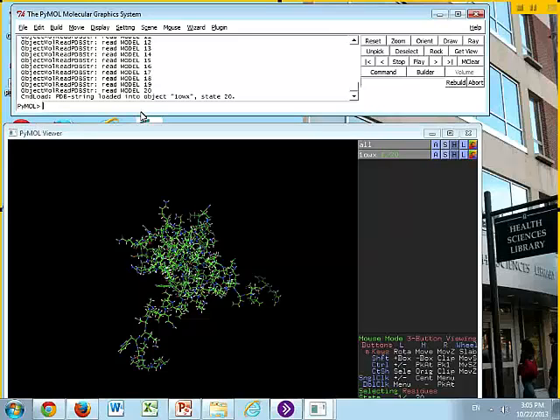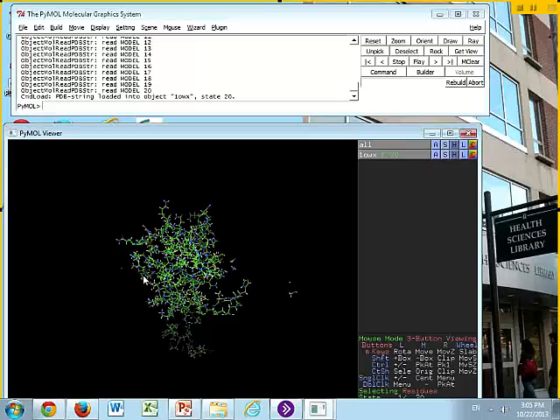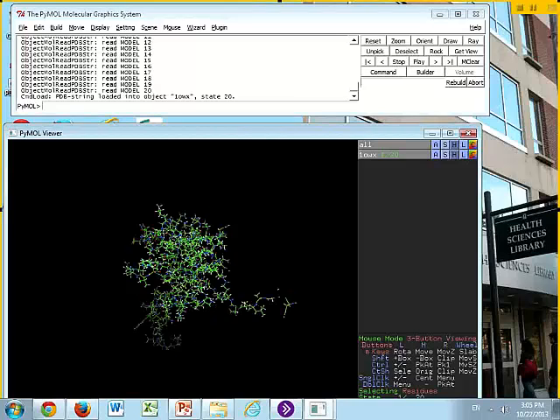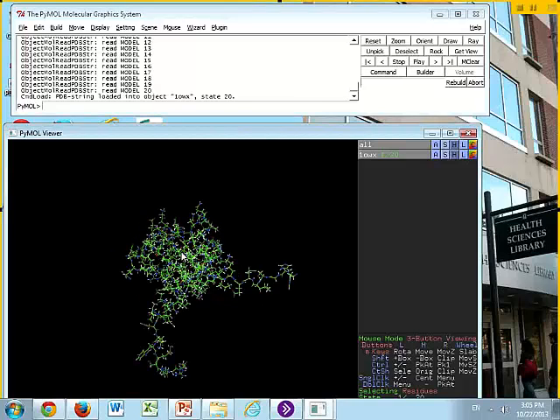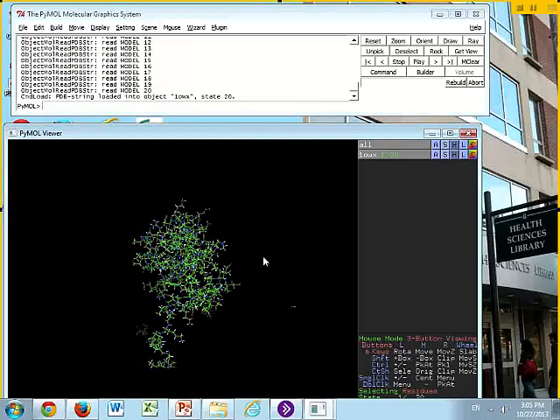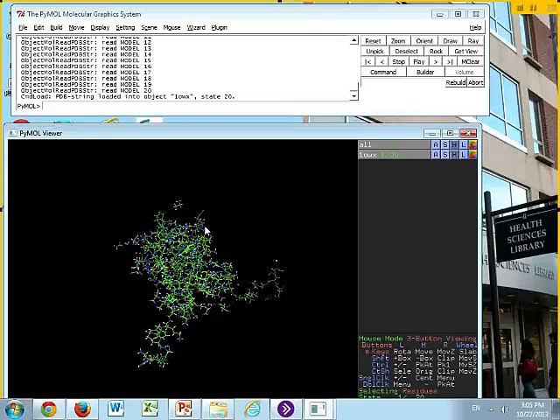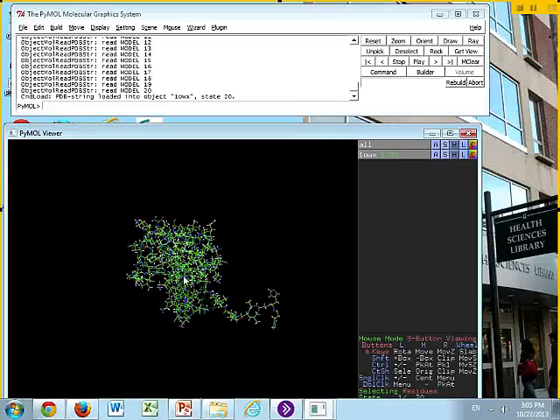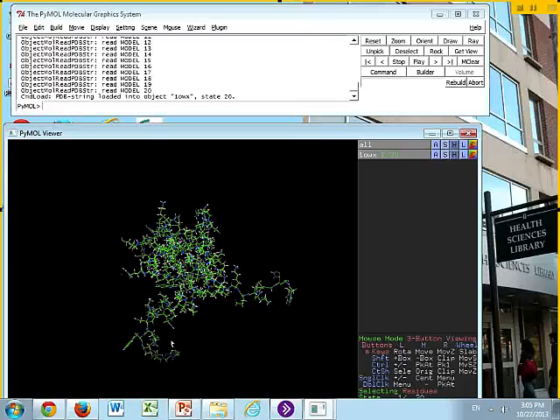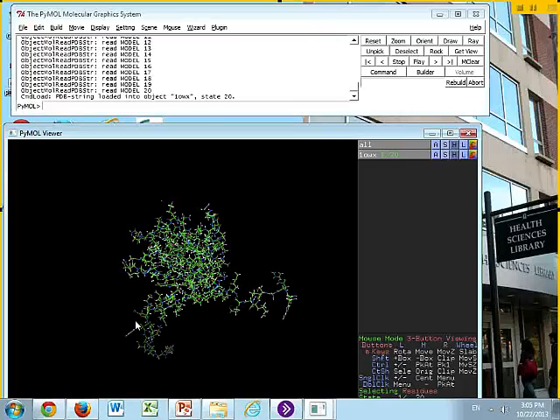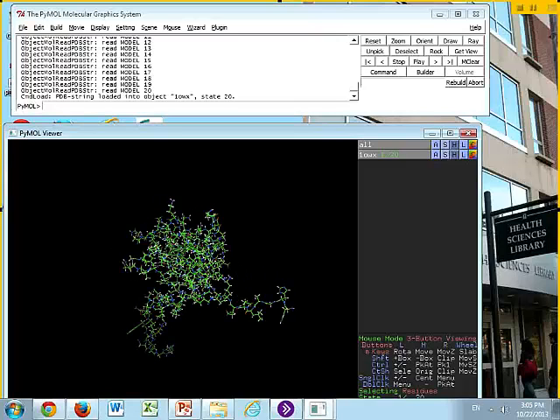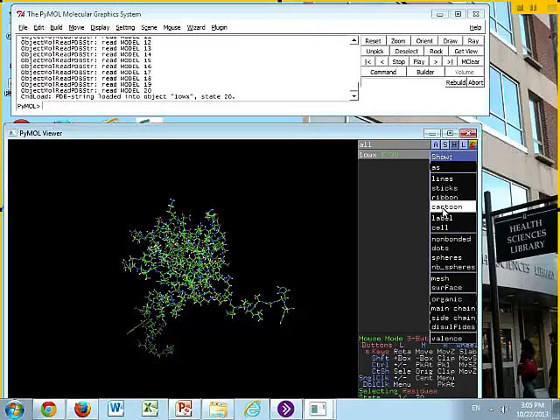Can you see, just type fetch space 1OWX and then hit return. Now you can, with your mouse, the left button on your mouse, you can rotate the molecule and look at it.